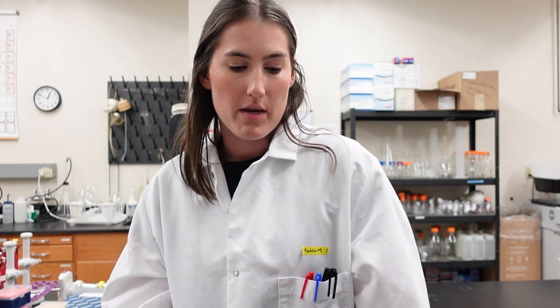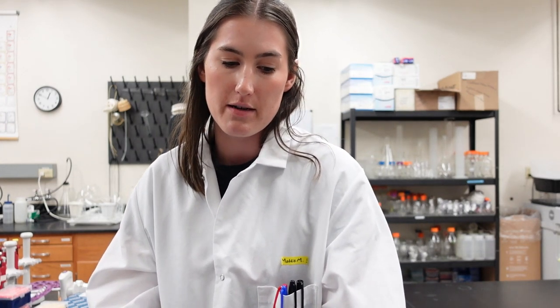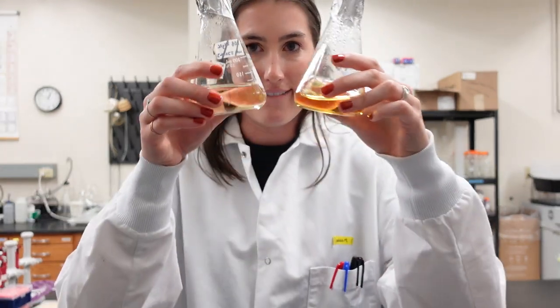So I want to get this done because my lab mate, who is showing me how to do PCR and all the sequencing bioinformatics stuff, should be here somewhat soon so that we can get PCR2 going and then quantification and all that this afternoon. So gotta get these inoculated.